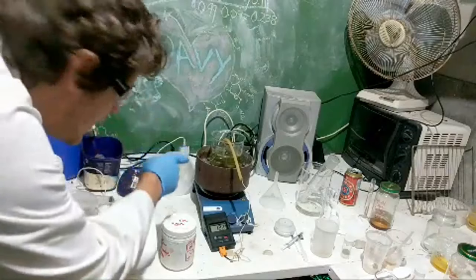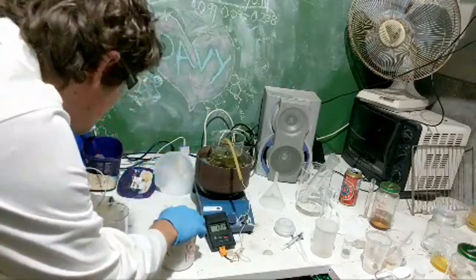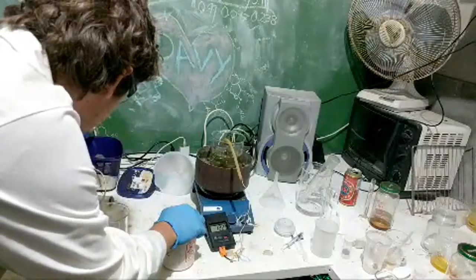So ideally we want to add hydroxide to that, but I just feel it's gonna be a little slow. So we'll let that cool down for a little bit longer.